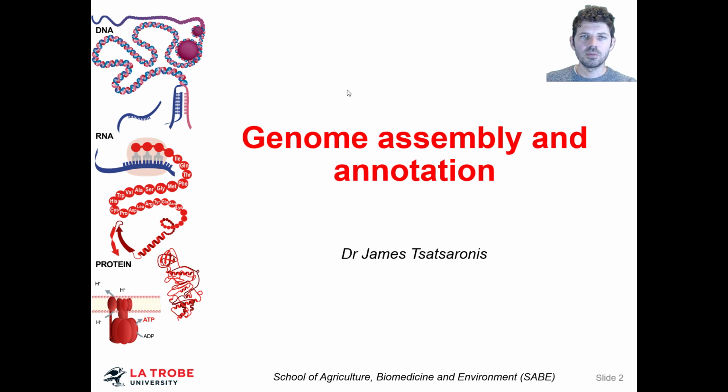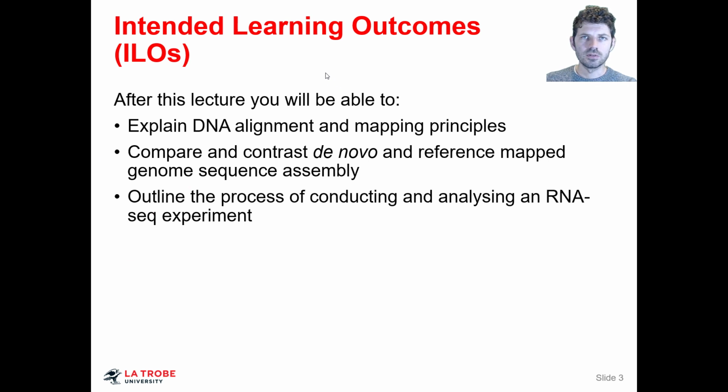In this lecture I'm going to be covering how you would actually go about analyzing your DNA sequence after next generation sequencing. After this lecture you should be able to explain how DNA alignment and mapping work in the context of genome analysis, compare and contrast the different processes of doing a de novo versus reference mapped genome sequence assembly, as well as outline the process of conducting and analyzing RNA-seq data.